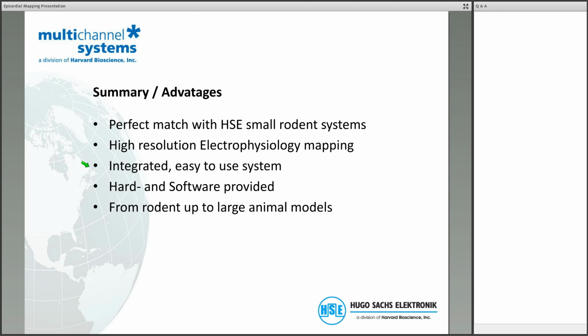And when we have an open day at the Natural and Medical Sciences Institute, this used to be an experiment where we allow people from the general public to position the array in certain positions. And it is usually an experiment that is amazing people when they see how easy it is to get this mapping. And if the general public is amazed by these recordings, when you show it to scientists, you get these maps where you normally spend days in analysis, you get this in real time with every single heartbeat. I think that really makes your life so much easier.